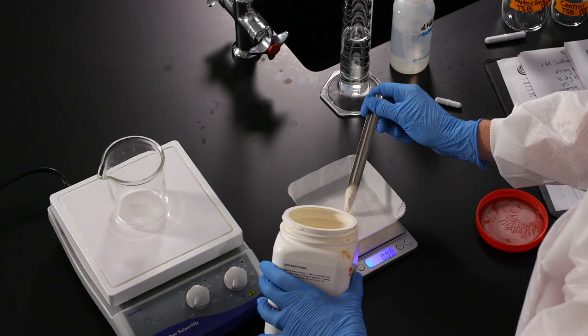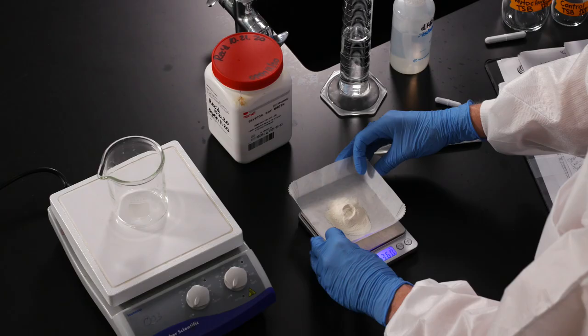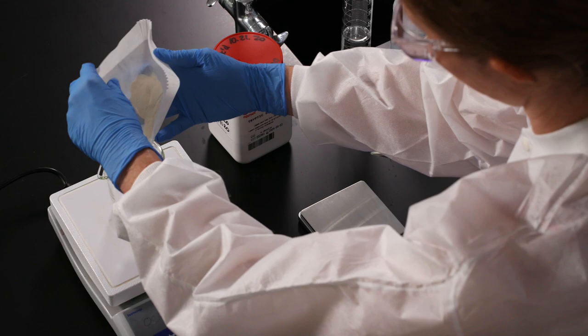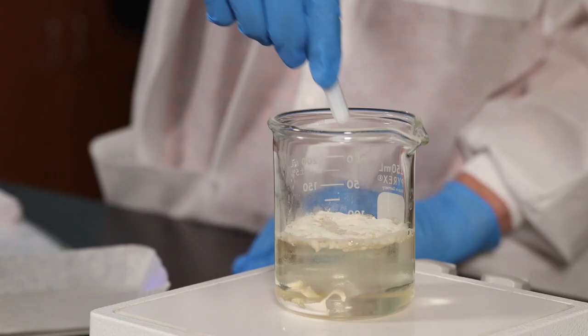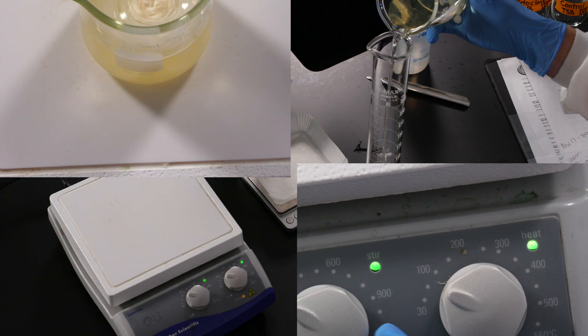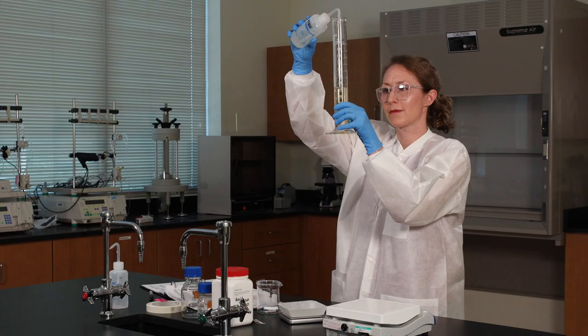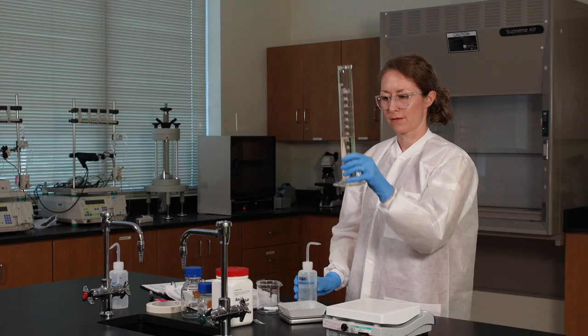Let's make the media. Weigh out 3.6 grams of soy broth powder. Then transfer the powder to a 150 ml beaker. Add about 100 ml of water and use the magnetic stir bar to dissolve the powder. You can also use the heating element on the stir plate to help the mixture dissolve faster. Pour the mixture into a 200 ml graduated cylinder and add water to bring it to a final volume of 120 ml.